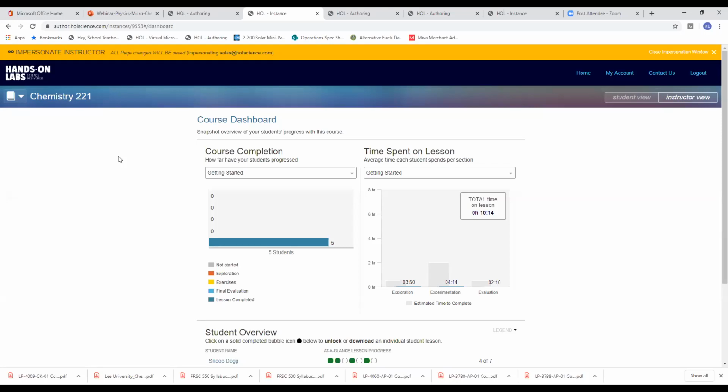If I had these to deal with, I would simply squirt them in a paper towel. That's me. Nothing's going to be flammable. Nothing's going to digest the cellulose in there that students are using. But no, I can't tell your students to put something down the drain when I know for a fact, in California especially, that is not good. So, thank you for that question.